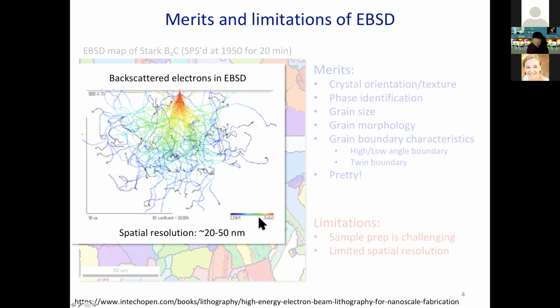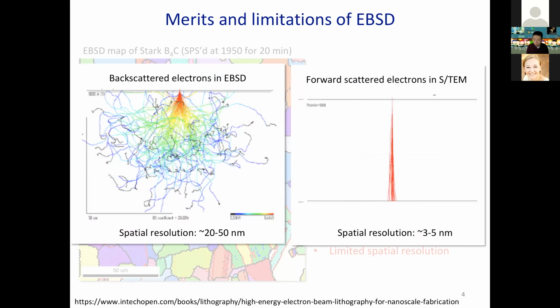In TEM, the advantage is the sample is not thick anymore, it's fairly thin. The sample thickness is finite. So when the electron beam passes through the specimen, there's still some scattering going on. There's some beam broadening going on, but not as bad as in EBSD. So we can dramatically improve the spatial resolution. On the TEM microscope at MIC, the finest spot we can tune the beam to is about 3 nanometers. Considering some level of broadening, we can easily get 5 nanometer spatial resolution.